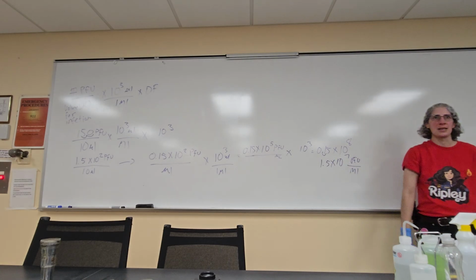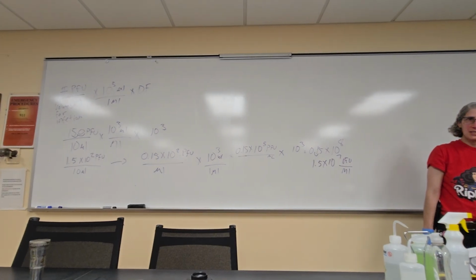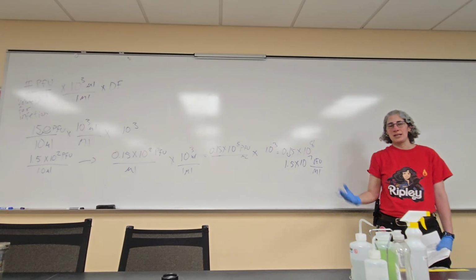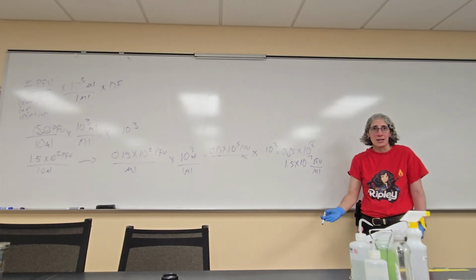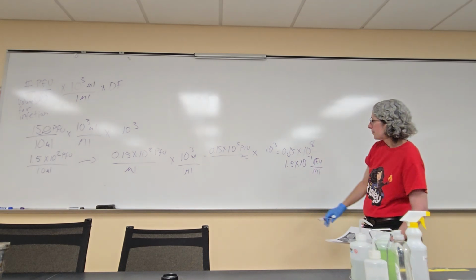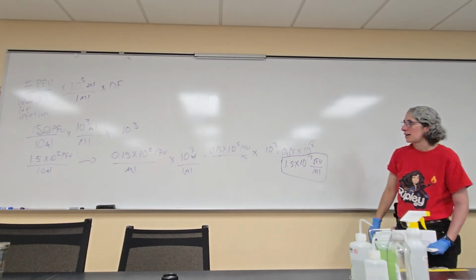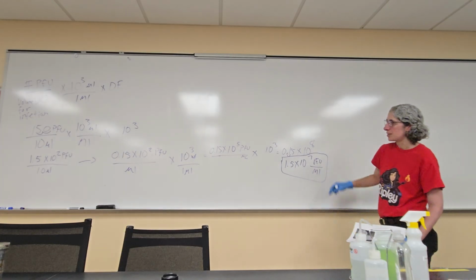per mil, okay? I always recommend students do this, and if you have a fancy calculator, check it on the fancy calculator. And the more you do this, the easier this is going to get, and then you won't have to rely on the fancy calculator, and you'll actually trust what you're doing, okay? So this is the first formula, all right? So I'm going to leave this number here and erase the rest, so that we can talk about the other formula that is used, and it should match this number here.